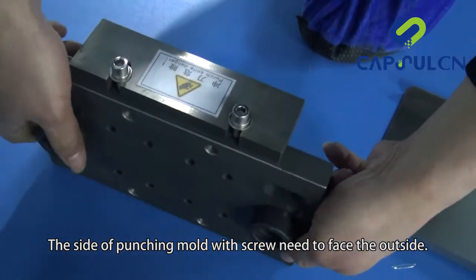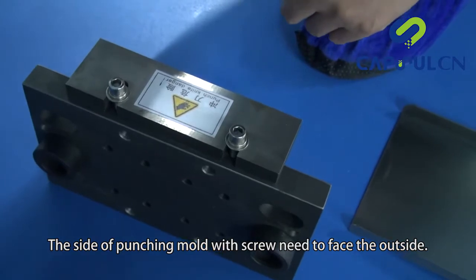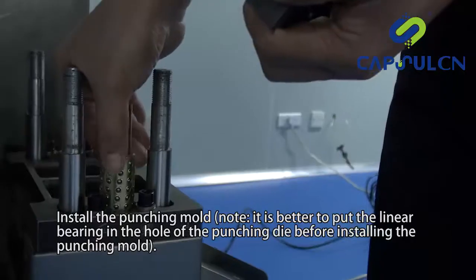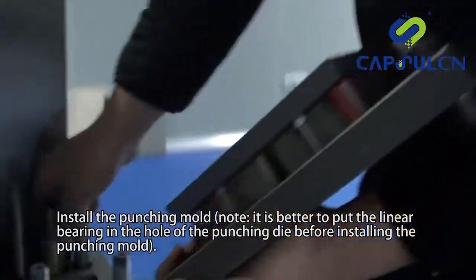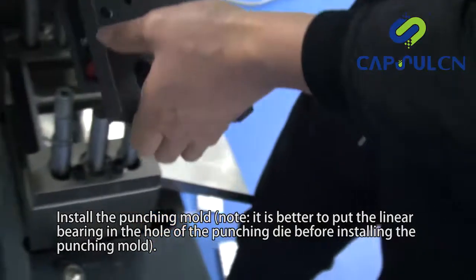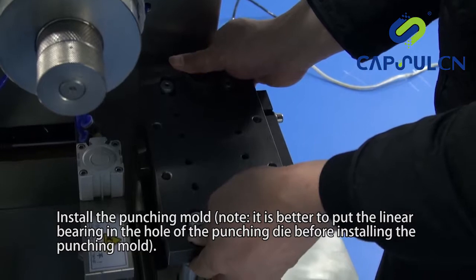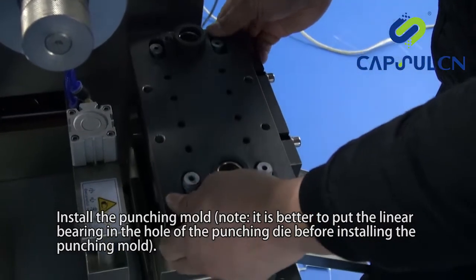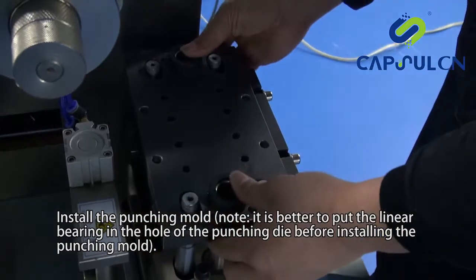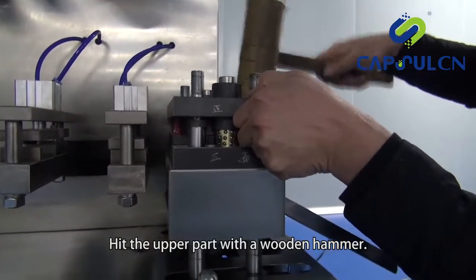The side of punching mold with screw needs to face the outside. Install the punching mold. Note: it is better to put the linear bearing in the hole of the punching die before installing the punching mold. Hit the upper part with a wooden hammer.